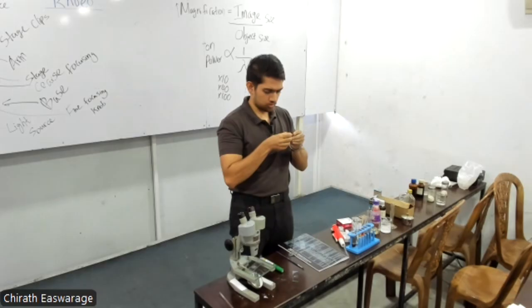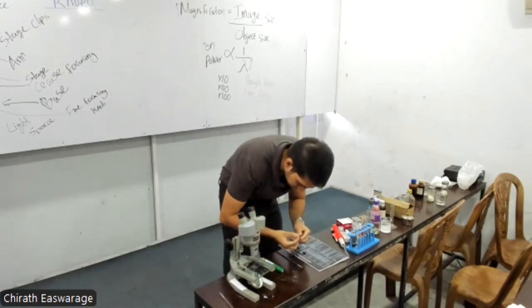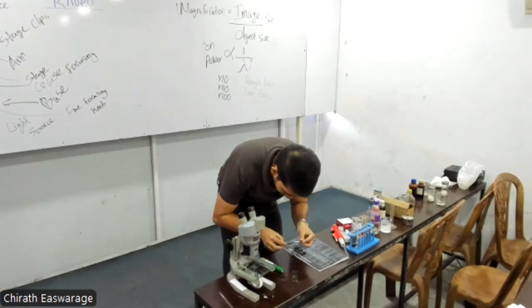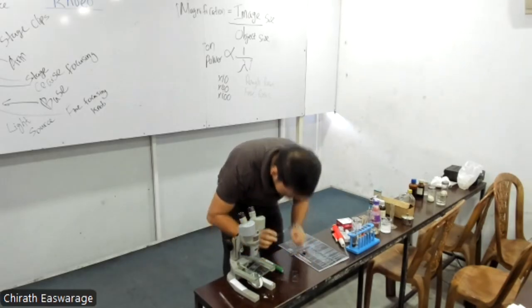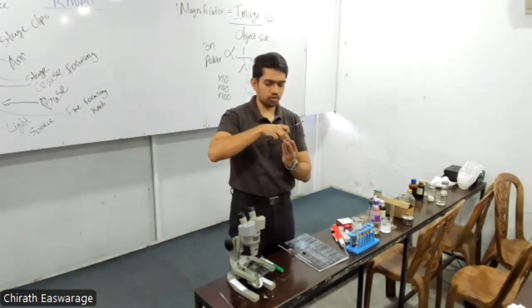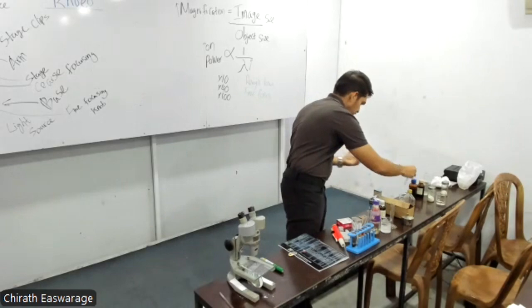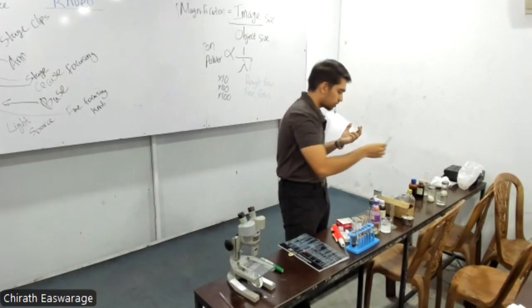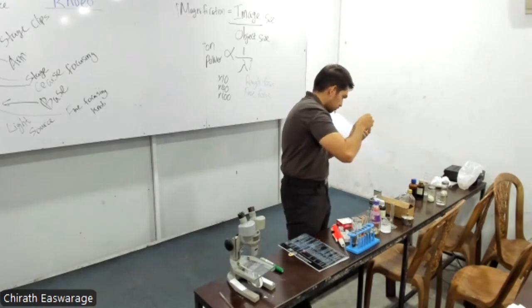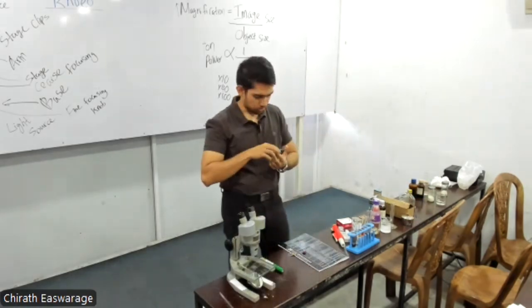I think this one is nice. I don't have a watch glass, but you don't need exactly a watch glass. So you transfer it to the glass slide and put another drop of water. Any question? Some drops of water. Online students, you can see, right?